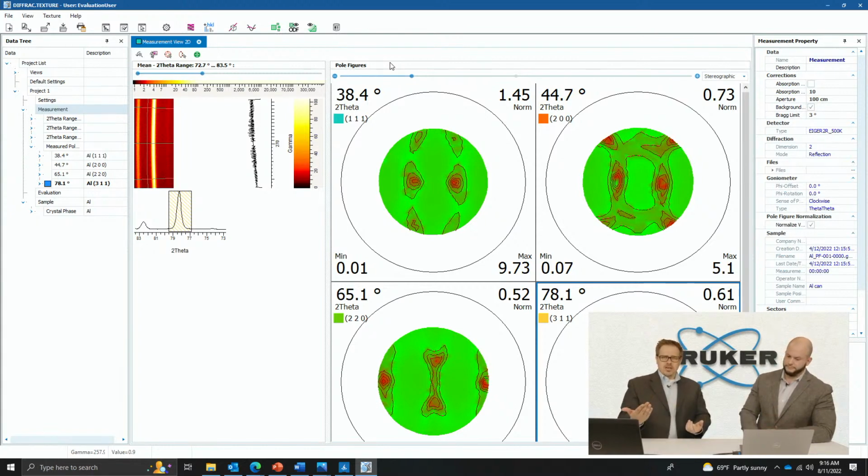On the other hand, the method of components was developed more of a material science route, where we said, let's start with the actual materials. And let's assume that one is pointing this way and one is pointing that way, and then let's regress that against the raw data. So those are the two differences. So spherical harmonics, that's pretty simple to do, right? It is. It's a couple of clicks in our software.